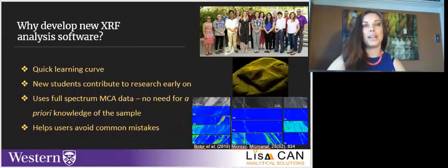So why develop a new XRF analysis software? X-ray fluorescence is a well-known method for the identification of chemical elements in materials. The incident X-ray excites an atom which subsequently emits fluorescent X-rays with energies that are characteristic. This means XRF can be used as a chemical fingerprint. Over the last 2 decades, element detection by XRF has been enhanced with the use of high-intensity synchrotron sources, making trace concentrations routinely detectable. However, XRF spectral analysis software packages have not kept up.